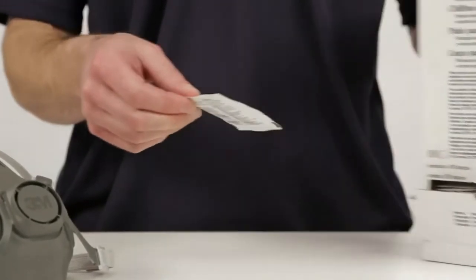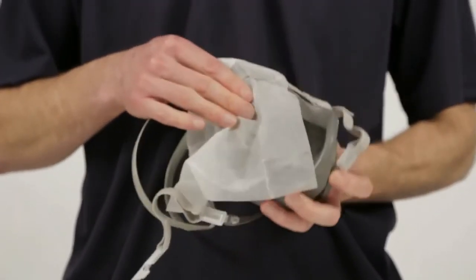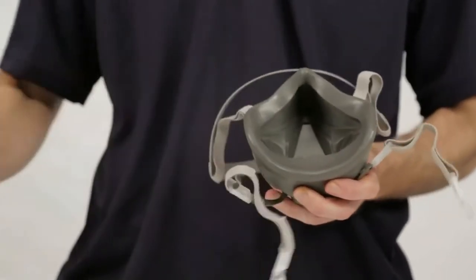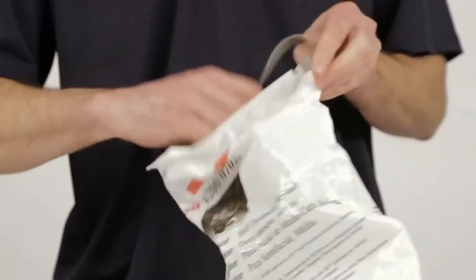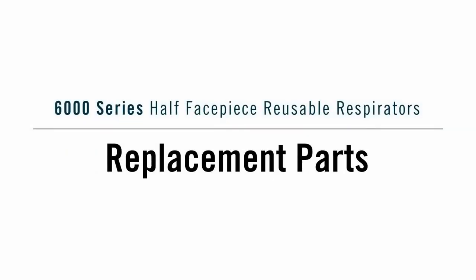3M respirator wipes may be used as an interim method in the cleaning schedule for individually assigned respirators, but they must not be the only method in place. When not in use, store your respirator in its resealable storage bag or other suitable storage container away from the contaminated areas. 6000 replacement parts.